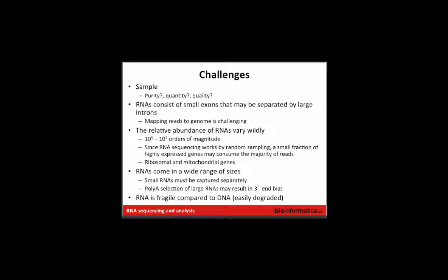This goes back to EST sequencing, cDNA library construction, where different strategies involving different types of hybridization would be used. And there are a bunch of enrichment strategies that also get at this. The most prominent one is that ribosomal RNAs occupy something like 95% of all transcripts. So of course, almost every RNA-seq library construction strategy involves trying to remove the ribosomal RNAs, and then you're still left with really highly expressed genes and really lowly expressed genes, and there are other strategies that try to further even that out.